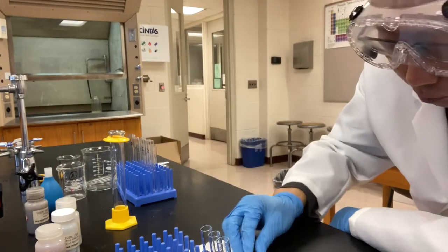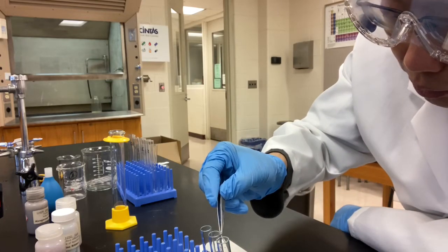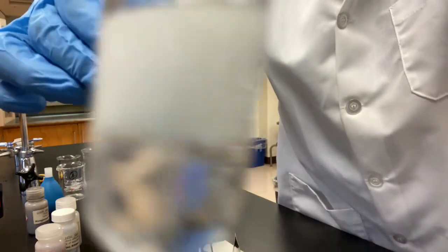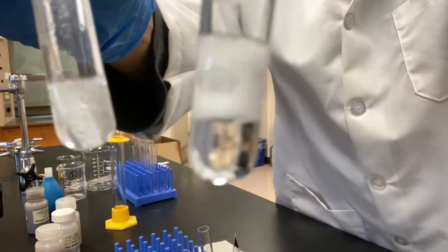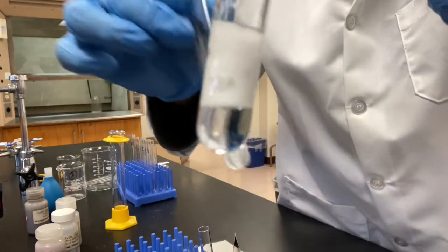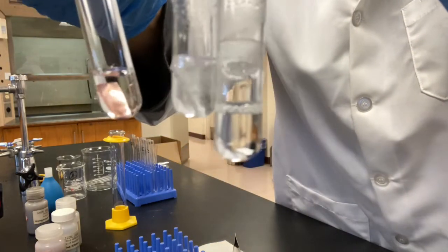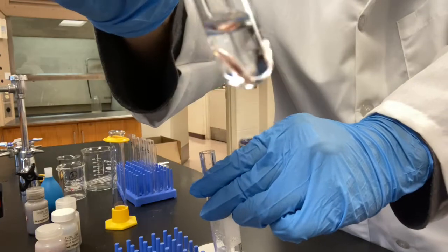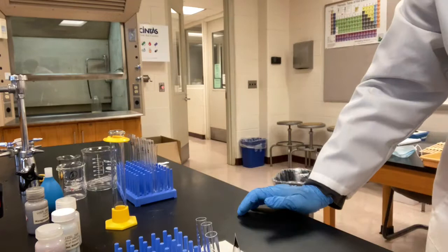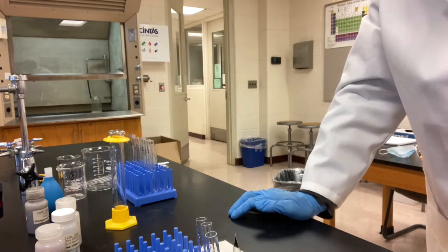I'm going to put magnesium in. We actually observed the magnesium a few minutes ago. Oh, look at that. Magnesium, zinc, okay, magnesium, zinc, and copper. No reaction at all. So the reaction rate of this part: magnesium reacts fastest, zinc the second, copper, no reaction.